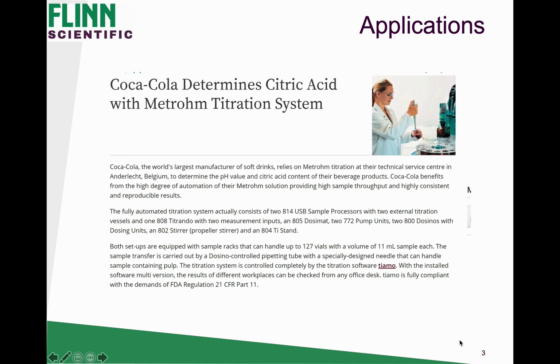So realize that there are different kinds of titration. I don't know if y'all remember, but in the beginning of the semester, y'all did a redox titration. So there are different things that you can look for within a titration. Clearly, what we're focusing on right now is acid-base titrations.